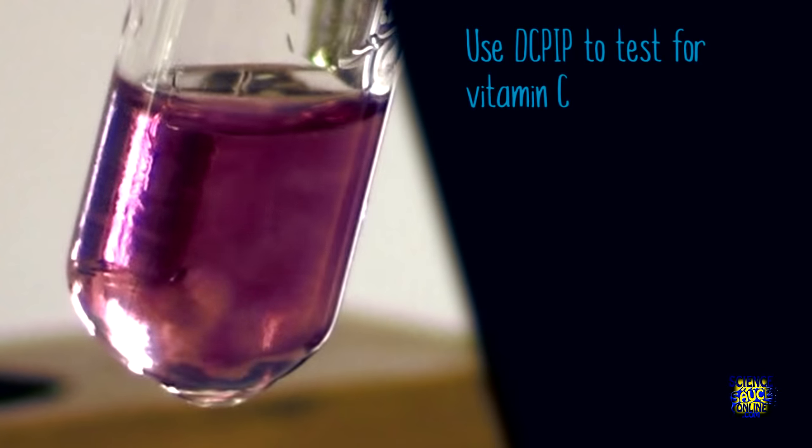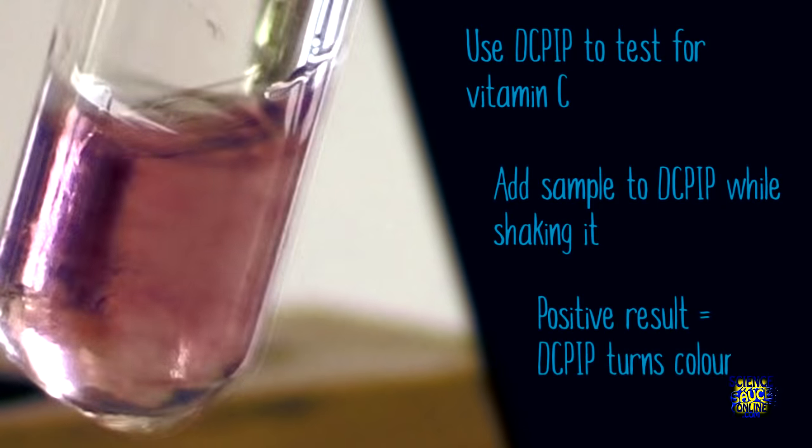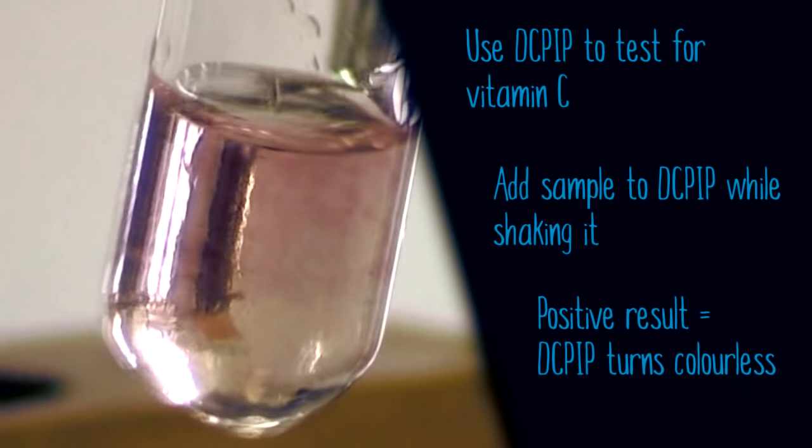So we use DC-PIP to test for the presence of vitamin C. We add our sample to DC-PIP while shaking it and the DC-PIP will turn colorless if vitamin C is present.